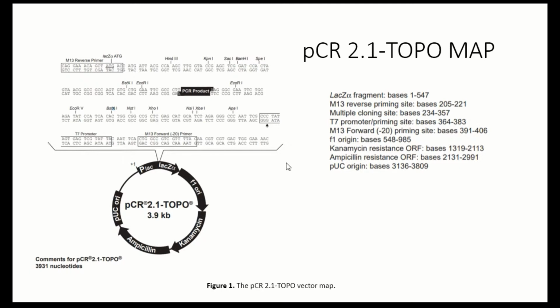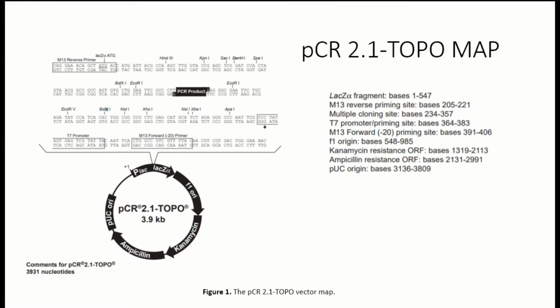It also avoids the recombination through RecA mutation for an easier extraction. With respect to the kind of ligation that is made in this part, there are several problematics that can be shown, mostly because of the specificity of the ends from the vector available for ligation. This is because they are not specific for each end from the PCR product. Therefore, they can be joined in the missense fragment and with an incorrect ligation.